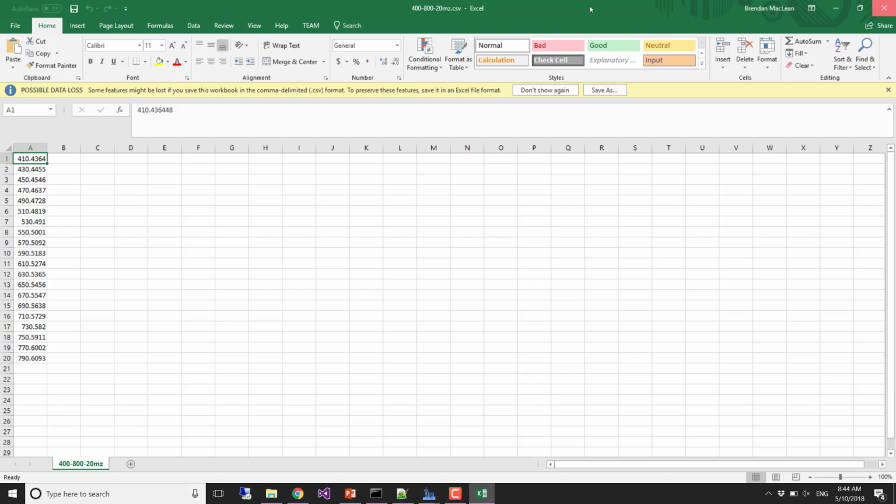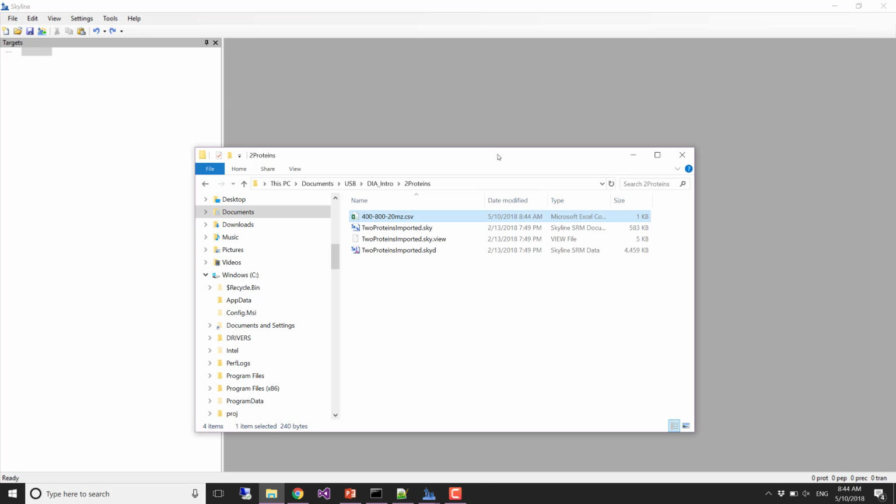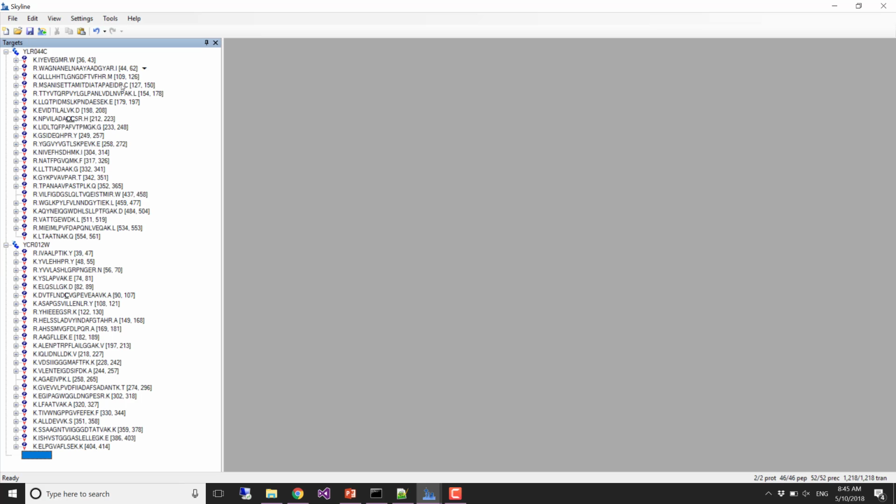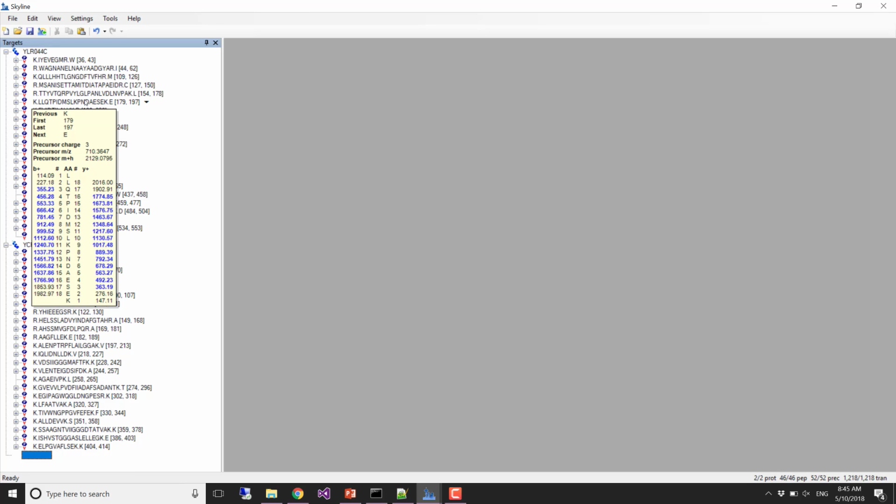Okay, so let's quickly go back to our method here. If I now redo all those steps, that's essentially the method that we would now like to extract out of the data.